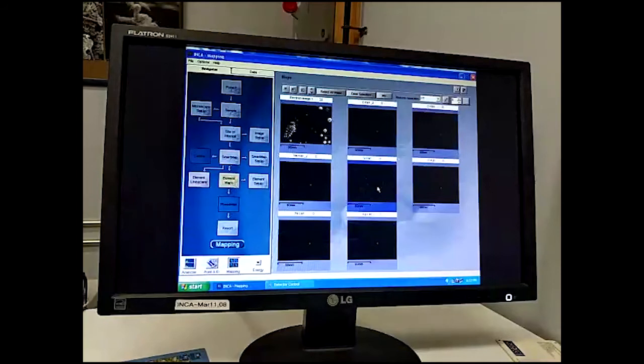I'm looking for silica in this sample. I'm also looking for carbon. I'm going to activate those by holding down the Shift key, click Mix, and it will generate me a map there in the top left corner. And this can be exported from here or either in the reporting section.